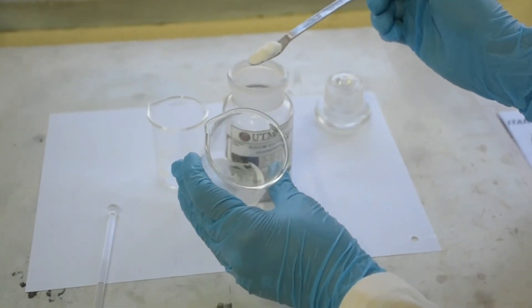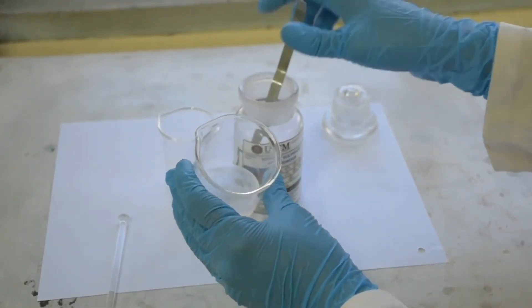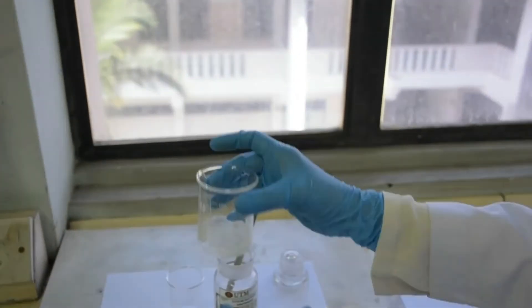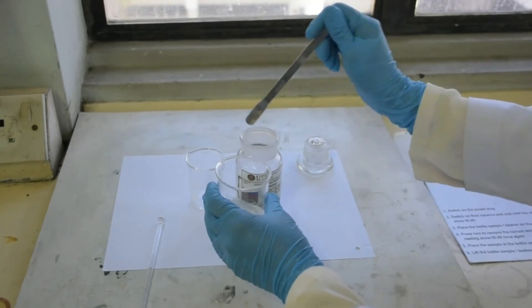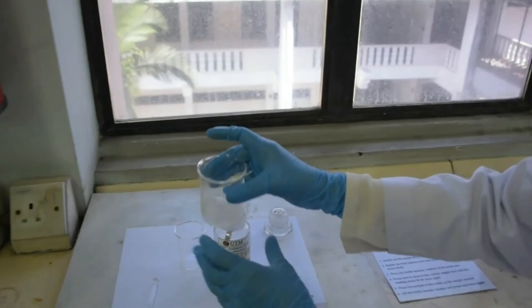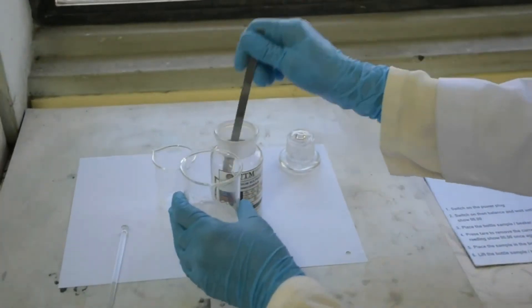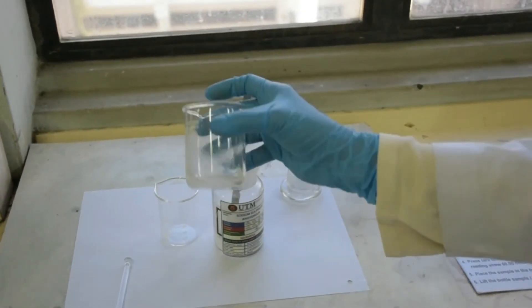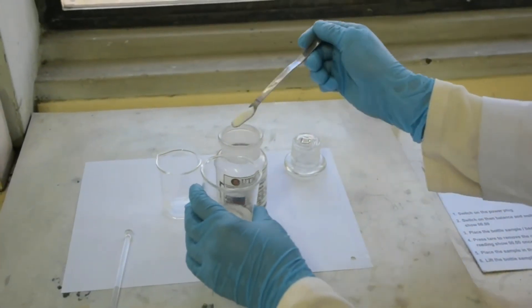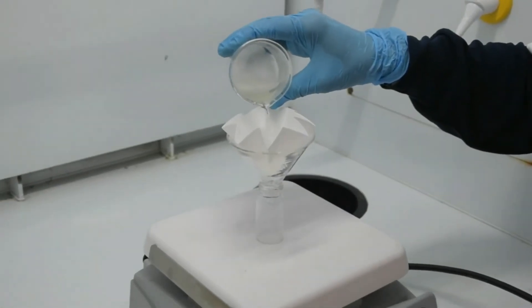Add a sufficient amount of anhydrous magnesium sulfate into the organic layer and stir the solution using a glass rod. Filter the solution using filter paper into a vial.